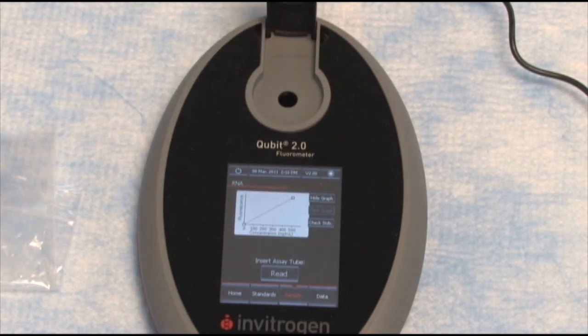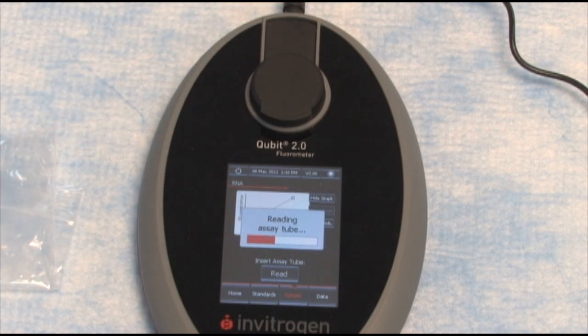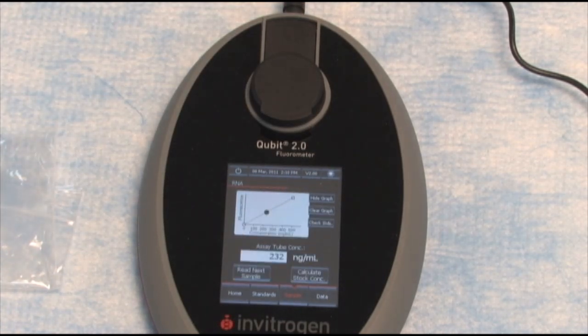Let's now read our sample. Insert, read. 232 nanograms per mil, which is exactly in range with what we were expecting.